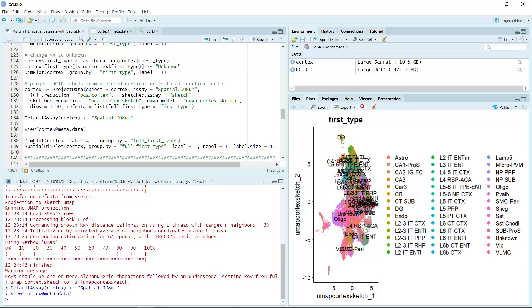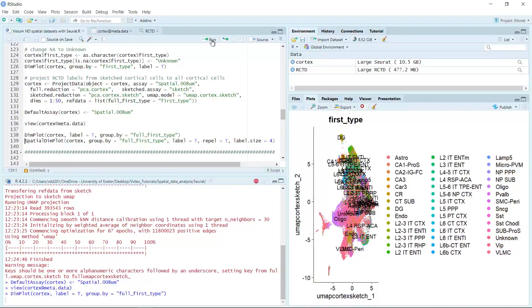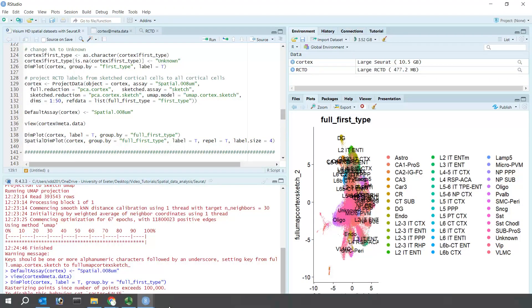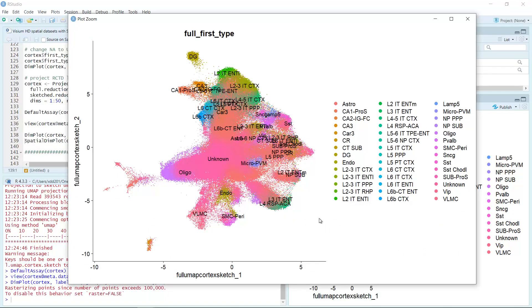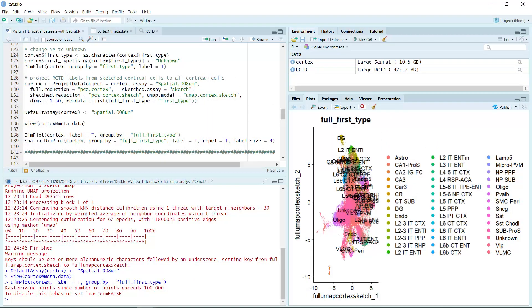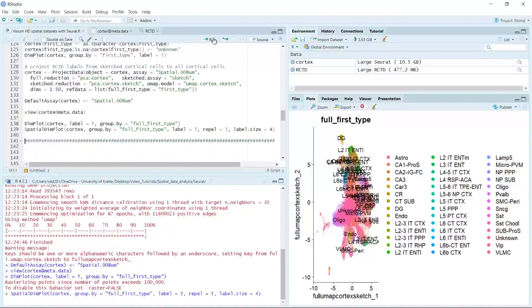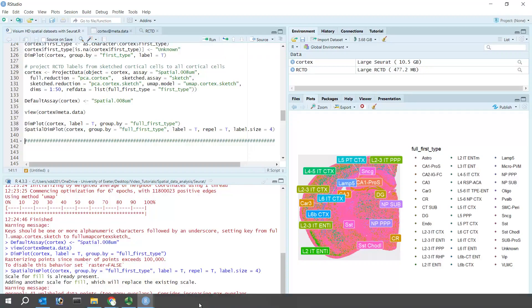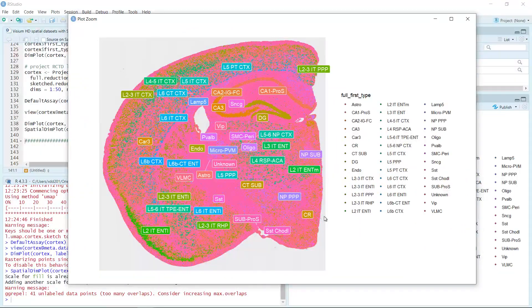Now we can use the dimplot plus the group_by function for the full first cell type to see the UMAP for the cell types in the full dataset. Let's zoom in — you can see now we have the cell type labeling for the full dataset, showing the cell clusters in the UMAP. We can also use the spatial dimplot function to see the cell types on the brain tissue. Let's run the spatial dimplot. You can see now we can see the cell types on the image.